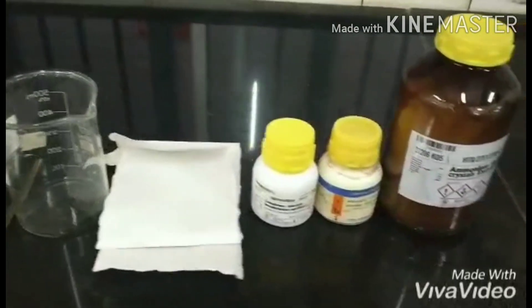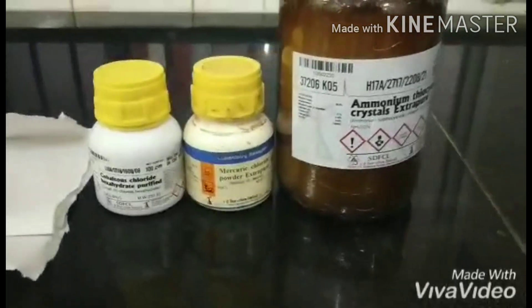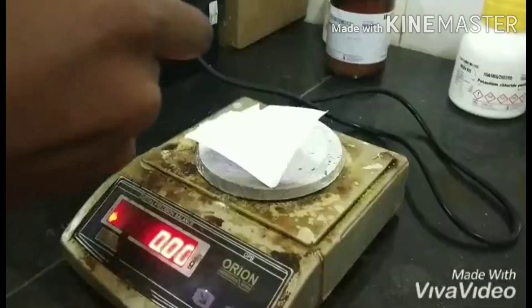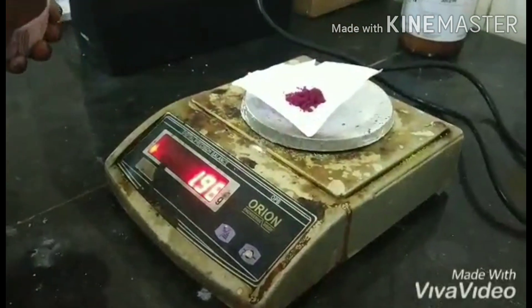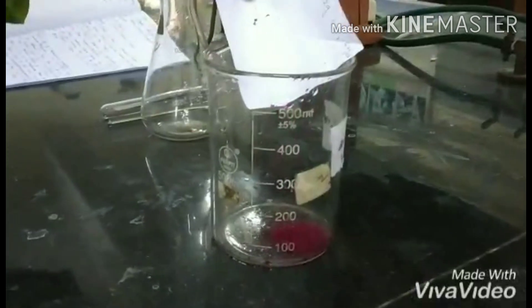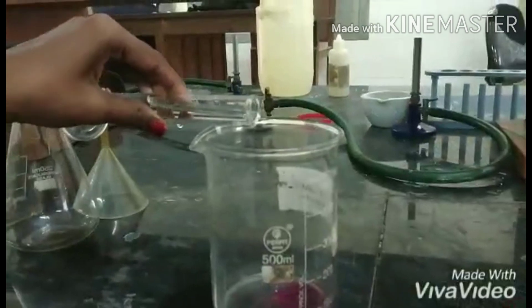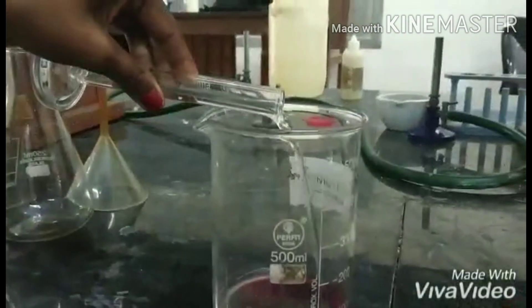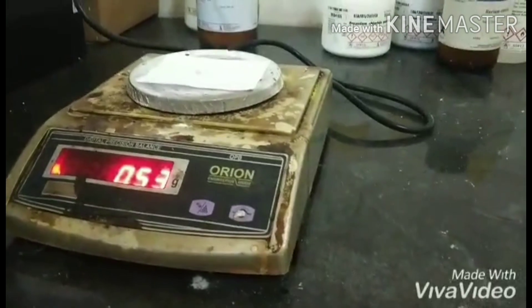The preparation of mercury tetrathiocyanate cobaltate(II) complex. Apparatus and reagents required for the preparation: weigh about exactly 2 grams of cobalt chloride and transfer it into a clean and dry beaker. To the same beaker, add 20 ml of water and weigh exactly 2.5 grams of ammonium thiocyanate.